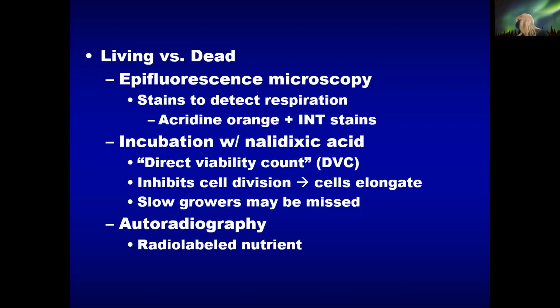Yeah, because you feed. So what you do is, like when I was doing experiments for my PhD, I would feed radio-labeled phosphorus into the microbe's environment, and they would pick that up and then incorporate it into their DNA or organic molecules. And so then you could use autoradiography to pick them up. You would say, yep, they took it up because they're definitely giving off radiation. I'll show you some pictures of what it would look like.